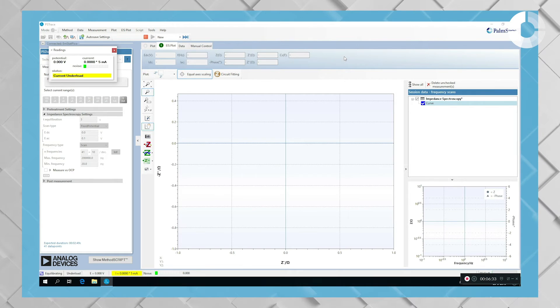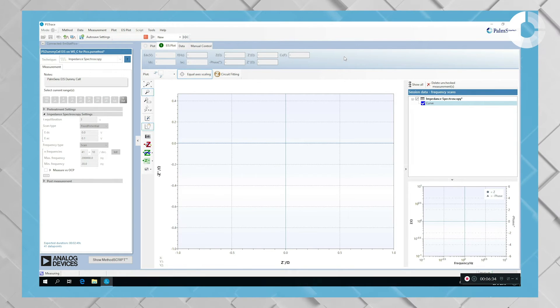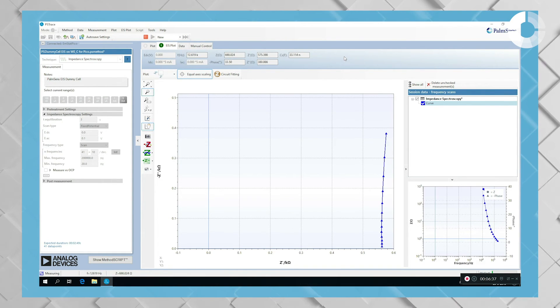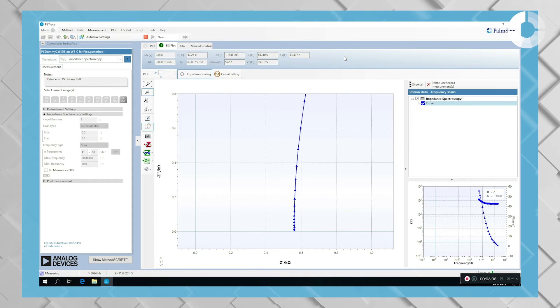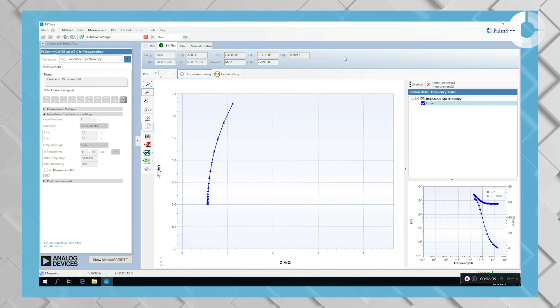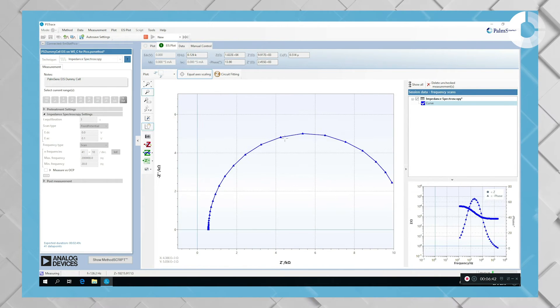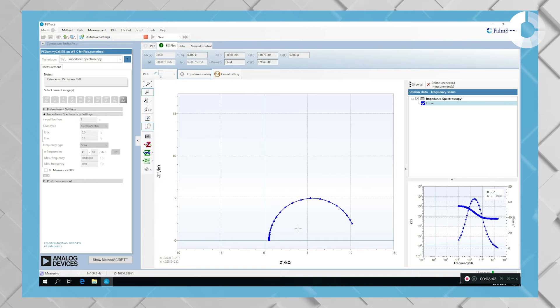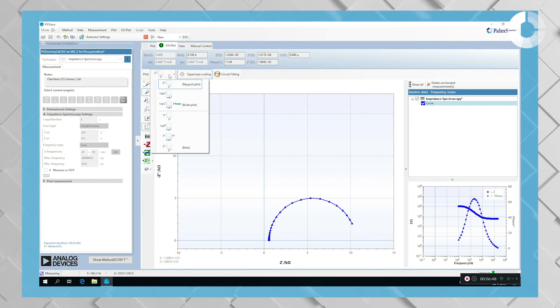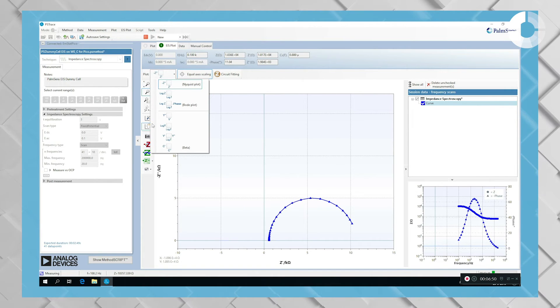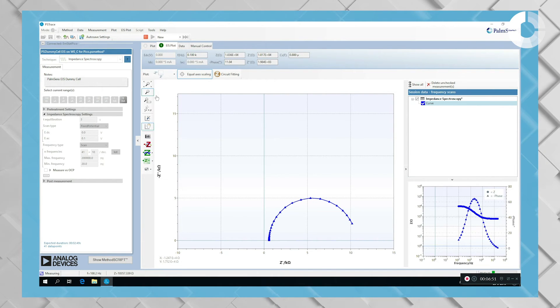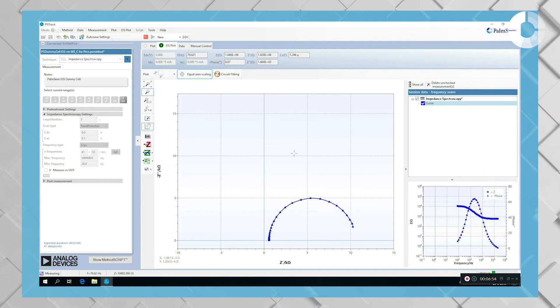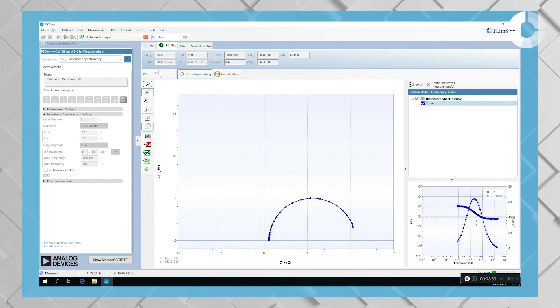So as typical for impedance measurements, the first points will go very quickly on the very high frequencies. The lower the frequency, the more the measurement will slow down. In the middle, you will see the Nyquist plot because that is the kind of plot I have selected in the top left of the plot window. And on the bottom right, you will always see Bode plot.